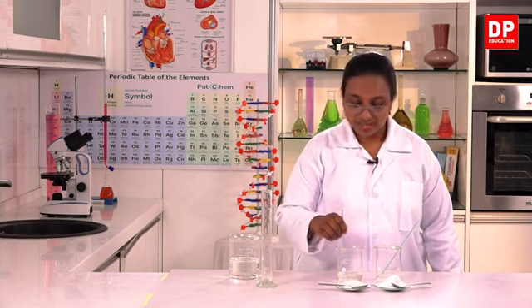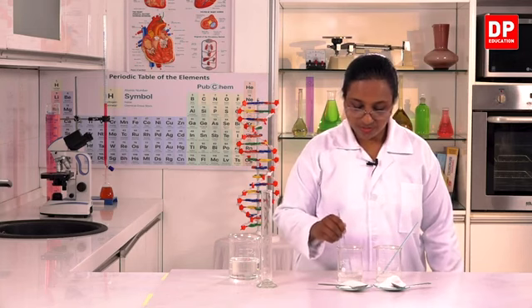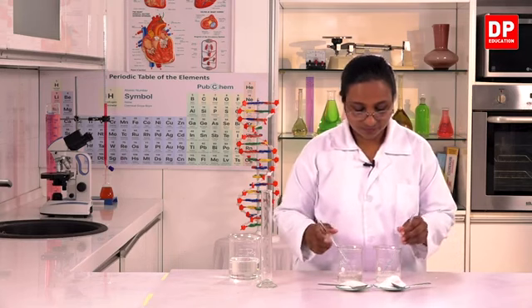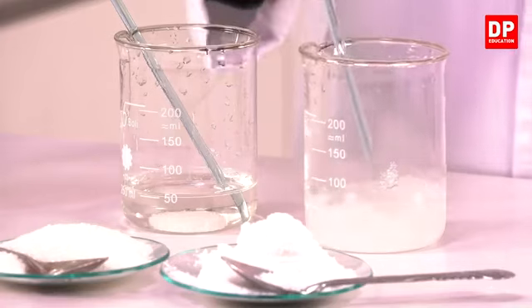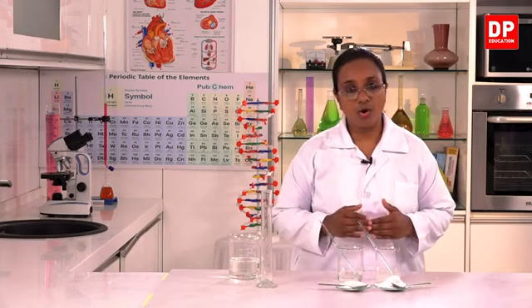So I am just doing this activity to observe how different solutes dissolve in the same solvent, to compare the solubility. So like this, we have to add more solute and dissolve them in water until it comes to a point where there is no more solute can dissolve in water.